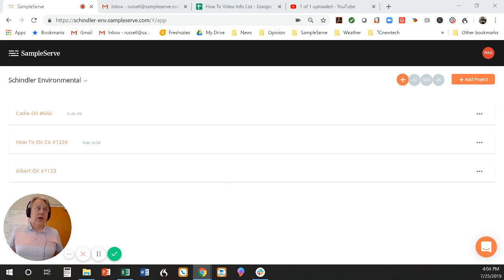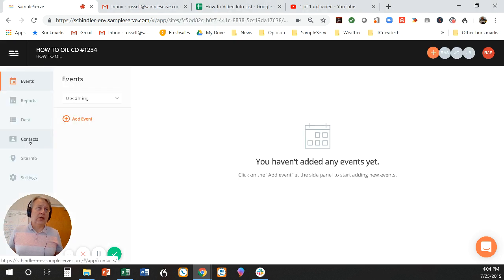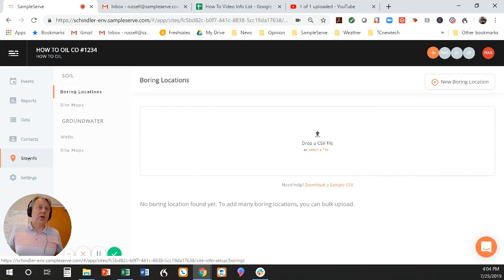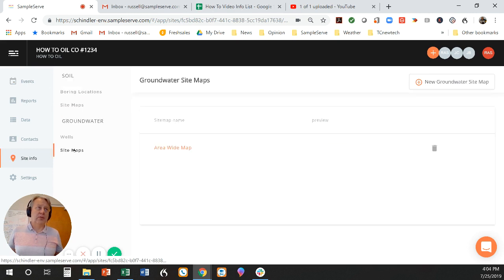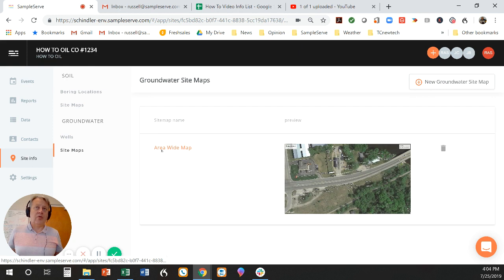We're going to go to our how-to oil company and click on that. We're going to go to site info, then we're going to click on sitemap. We've previously uploaded a map already — there it is. I've previously uploaded sample locations or well locations.